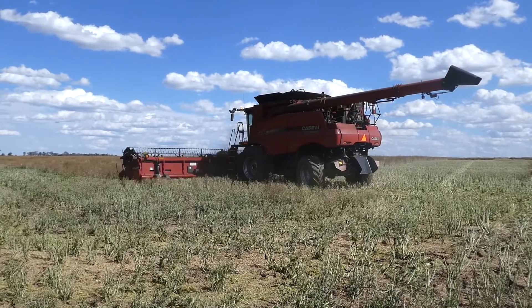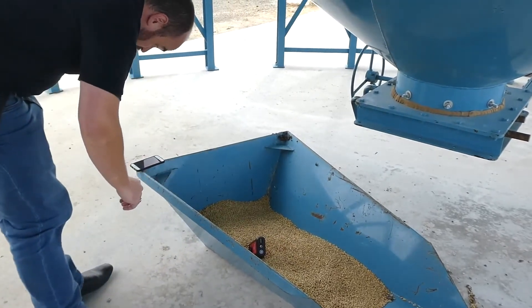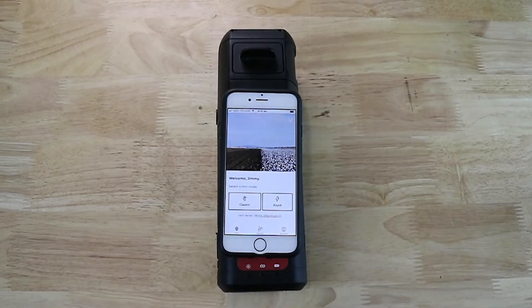With IP65 ingress protection, the Hone Lab is suitably protected for both dust and water on the Australian farm. The Hone Lab comes with a quad lock. Since the Hone Lab is operated through a mobile app, it's easy to attach a phone.